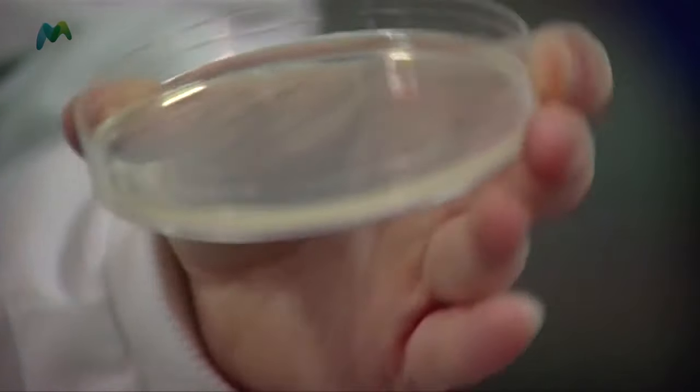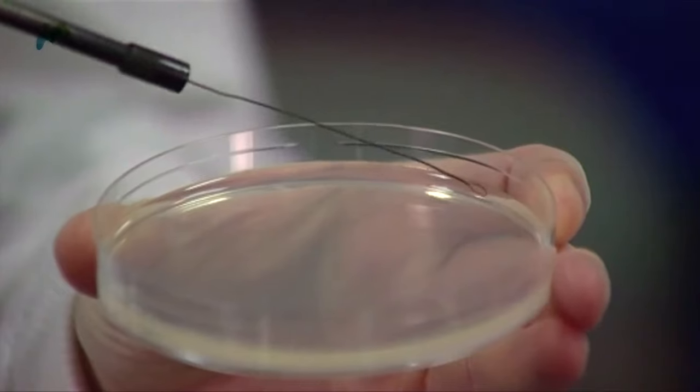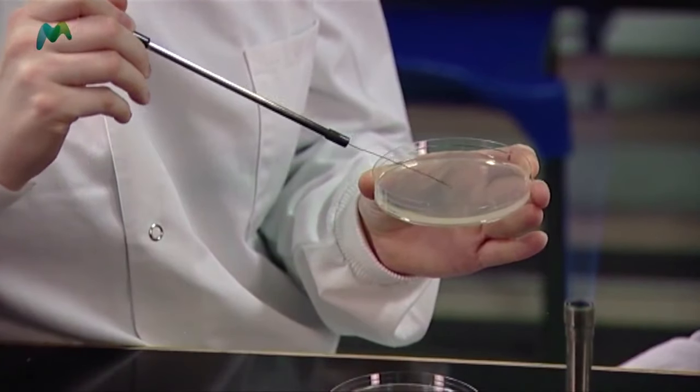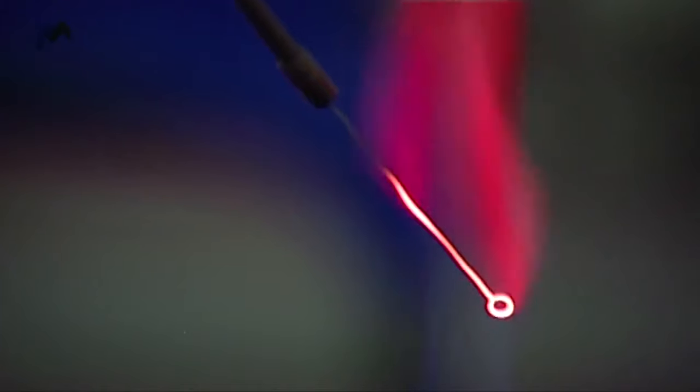The purpose is to obtain single colonies, and hopefully we'll get that effect. This is my last pass — three final lines, very careful not to dip into any previous lines, and I finish with a little zigzag flourish at the end. I finish off by sterilizing the loop and putting it down to cool.